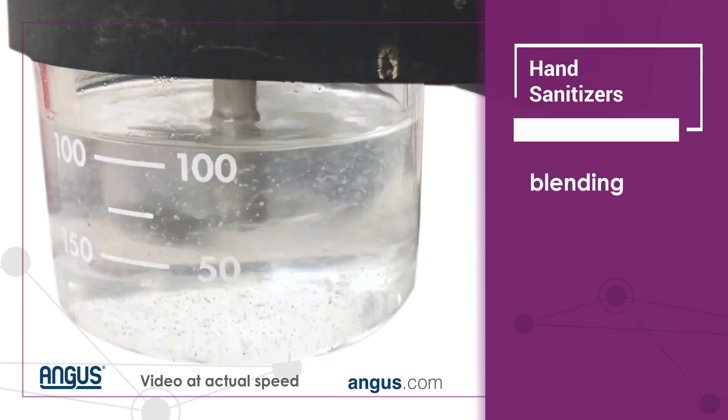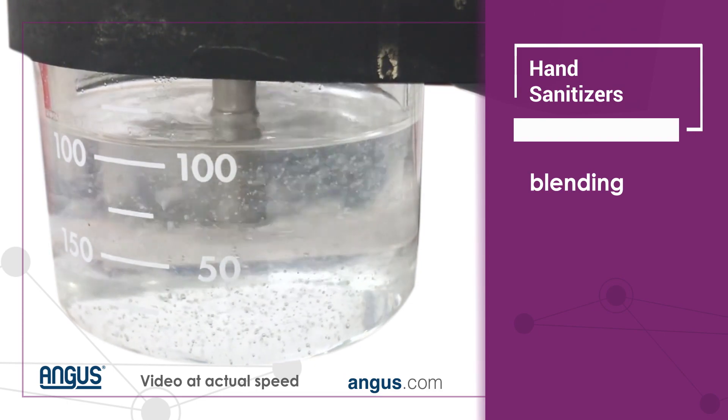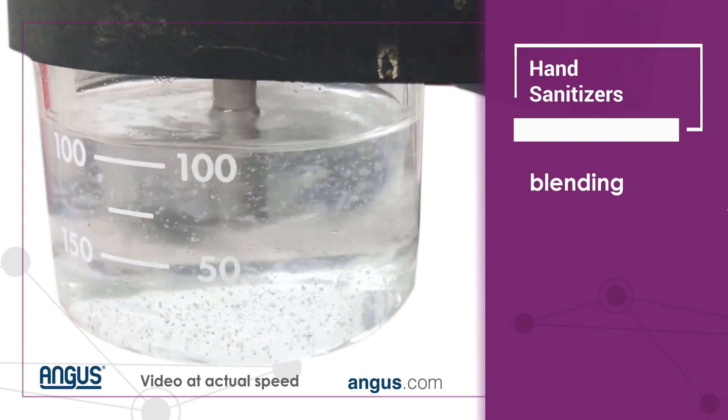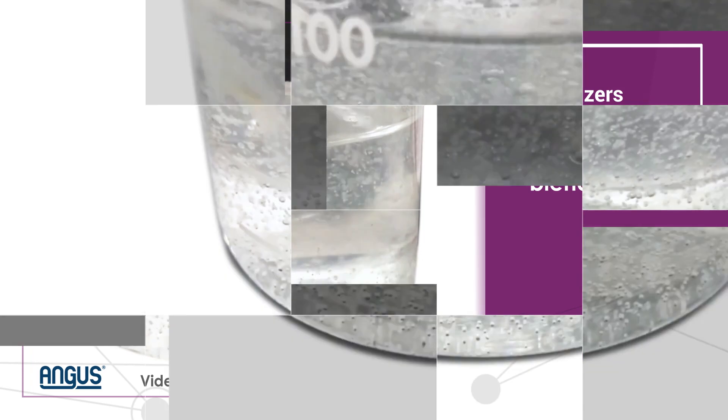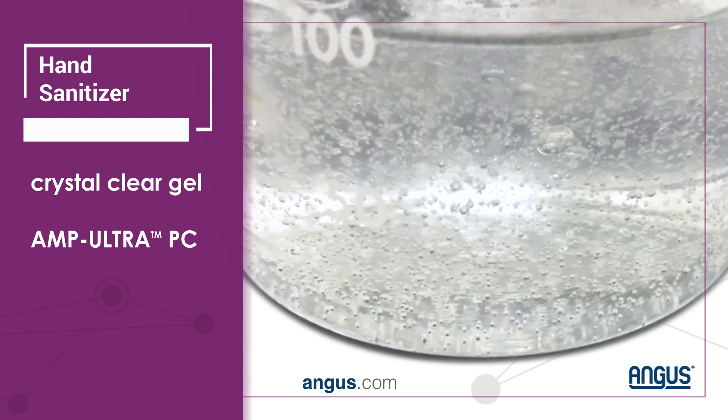As the AMP is added, the batch is neutralized and becomes crystal clear. The final result is a crystal clear gel of hand sanitizer made with AMP UltraPC-2000.